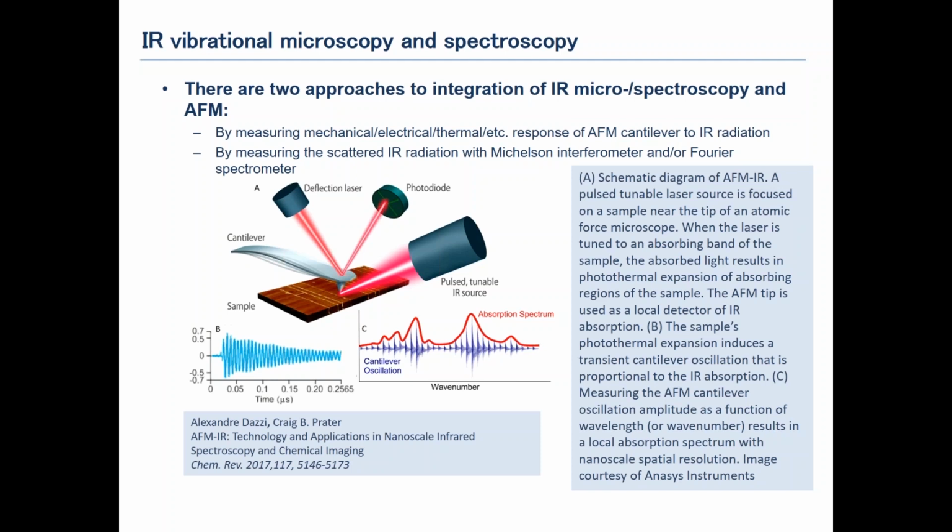So one just illuminates the area of interaction of the cantilever and the sample with infrared light, and then measures the spectrum. It is reported that in this regime it is possible to measure spectra of the samples, but there are some disadvantages of this mode because the thermal expansion works well just for a limited range of sample thickness.